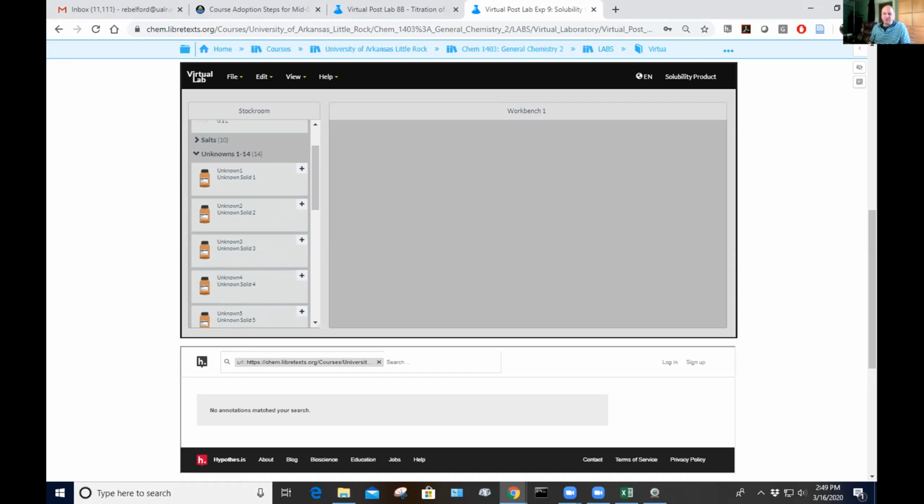Oh, let me also add, there was a question earlier in the chat about it not seeming to be any procedures. That was somewhat intentional. We have a simulation environment. We have a way to enter answers in most cases, or in some cases. There's also a lot of labs that aren't auto-grading, and it's just a simulation.